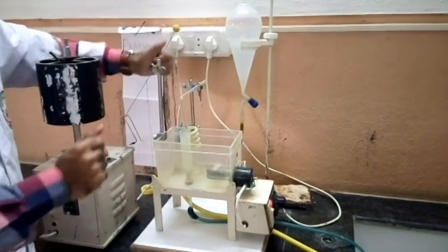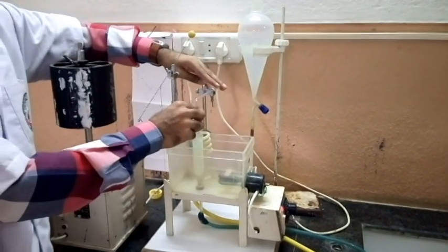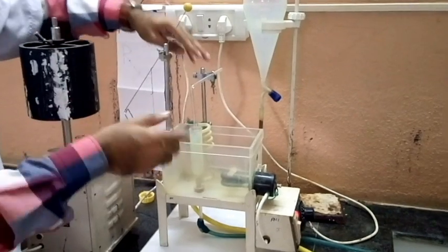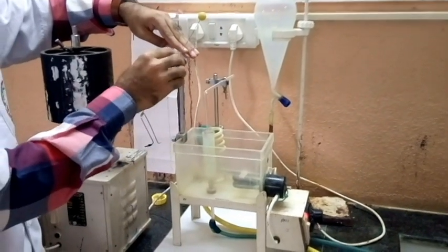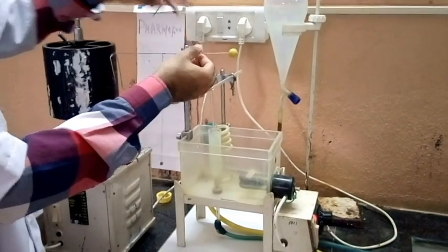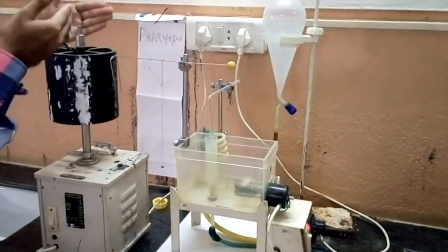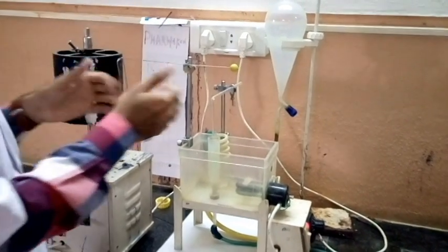The organ bath consists of two supporting stands. One is used to support the aerating tube which supplies oxygen to keep the tissue alive, and the other one has a specialized lever called the fulcrum into which we introduce the writing lever. The writing lever is used to record different dose responses of the tissue which is suspended.